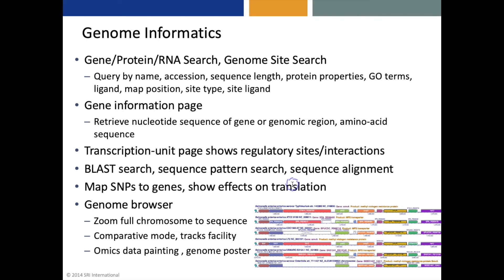The genome informatics capabilities of Pathway Tools include the abilities to search for genes, proteins, and RNAs, as well as to search for genome sites. These searches can let the user search by many different criteria. There's also a gene information page where the user can retrieve the nucleotide sequence of a gene or genomic region or the amino acid sequence of the product. There's a transcription unit page that shows regulatory sites and regulatory interactions. There's also a BLAST search, a sequence pattern search, and a sequence alignment capability.